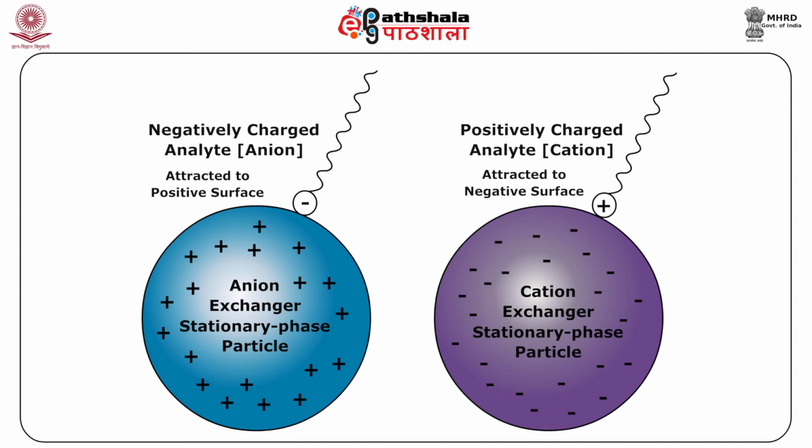As I just mentioned, there are two kinds of exchangers. It can be cation exchangers or anion exchangers. Now, a cation exchanger itself is negatively charged.